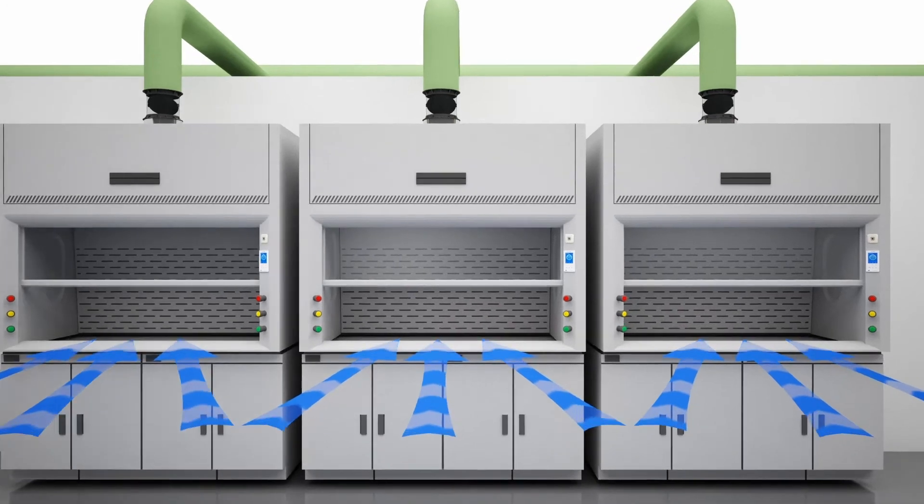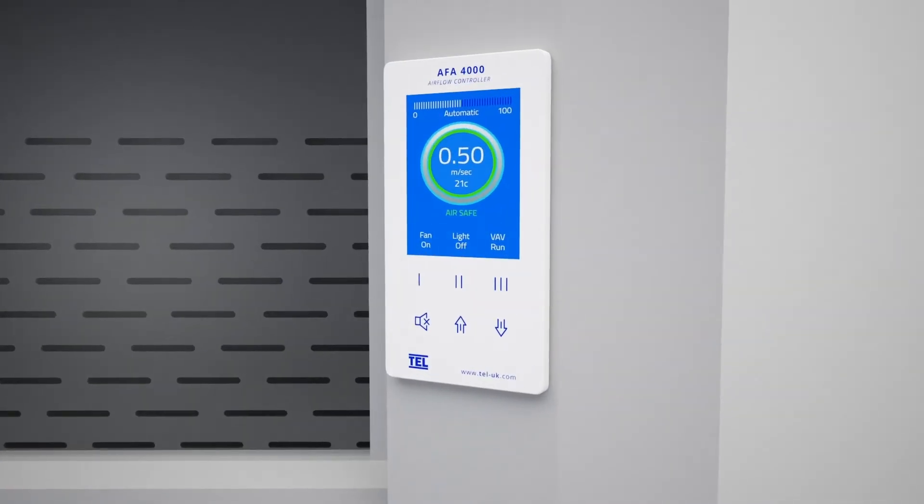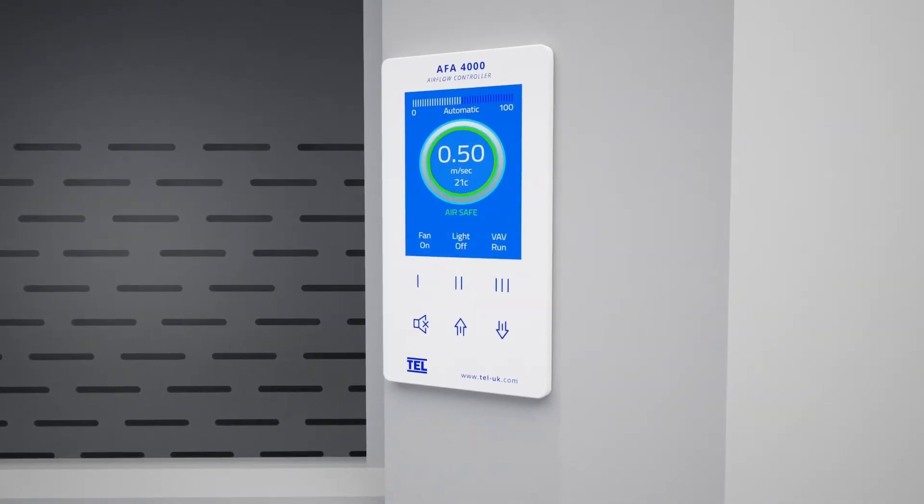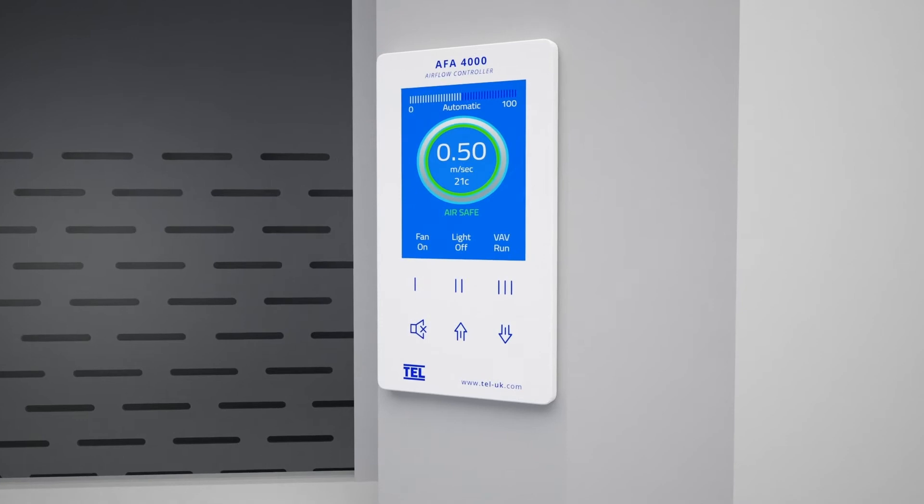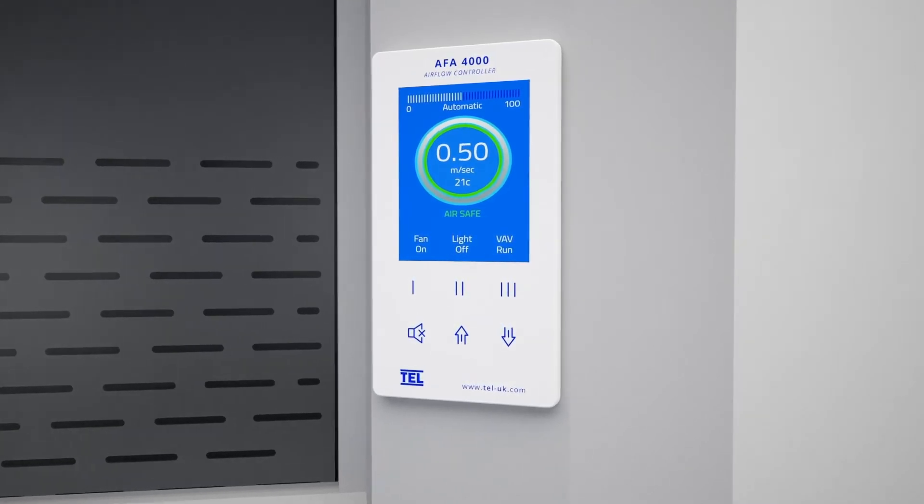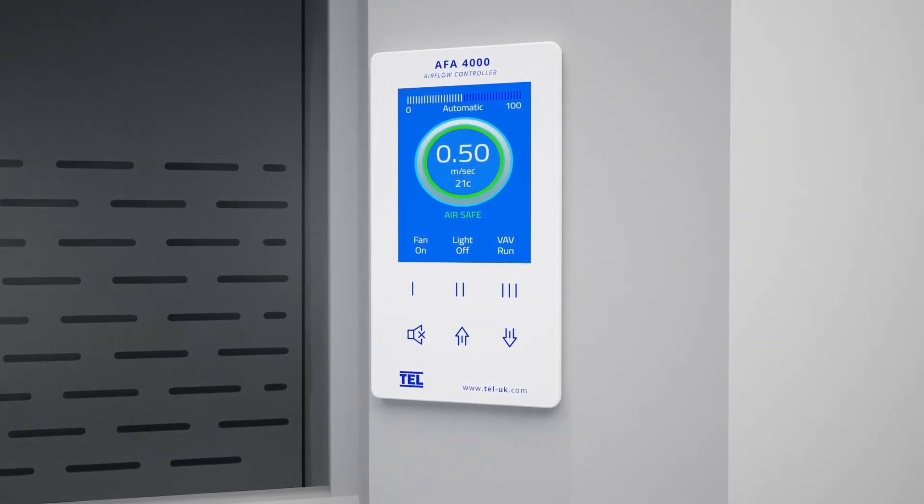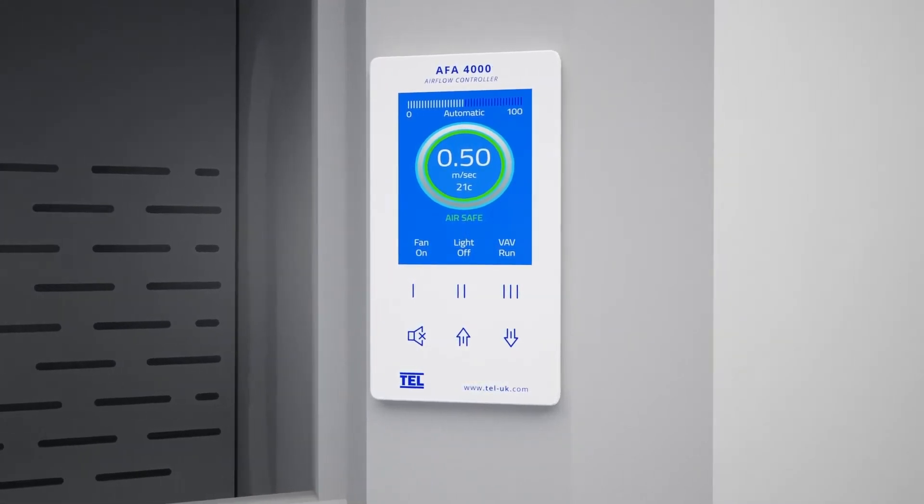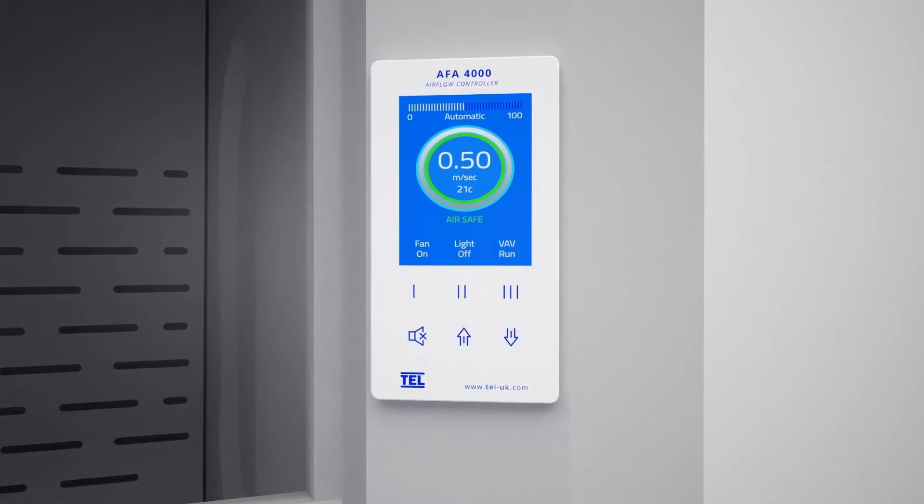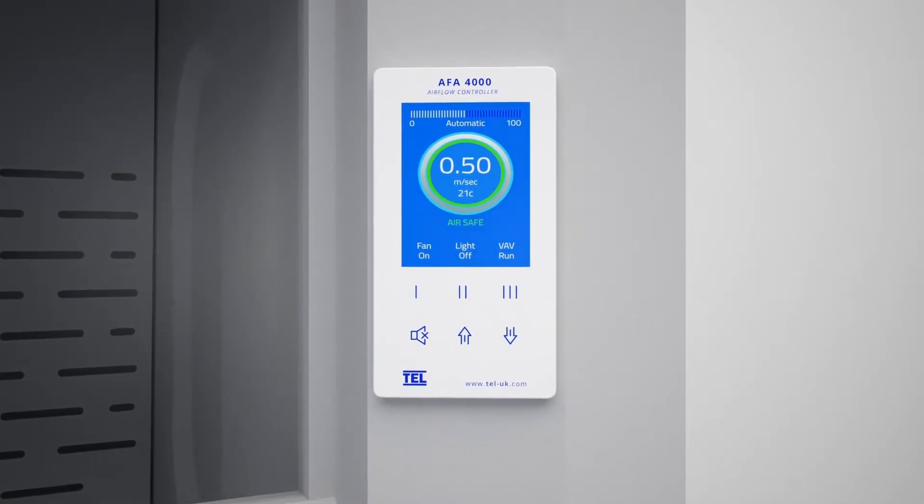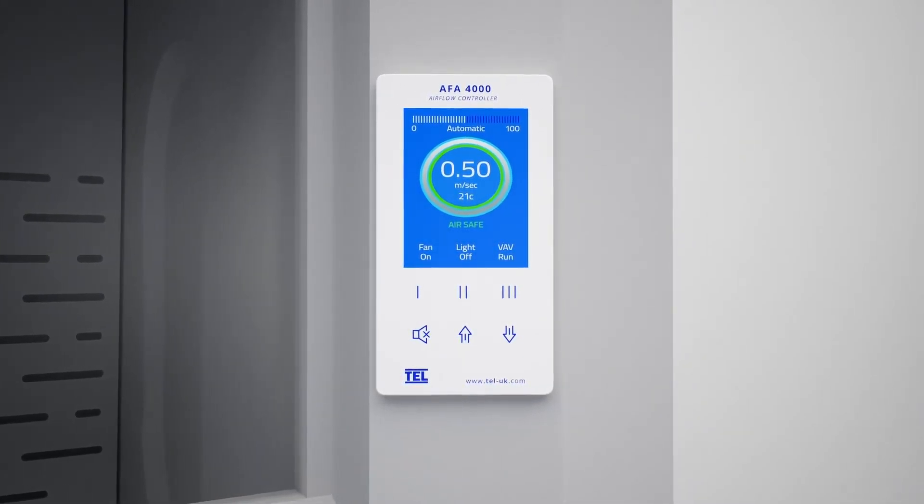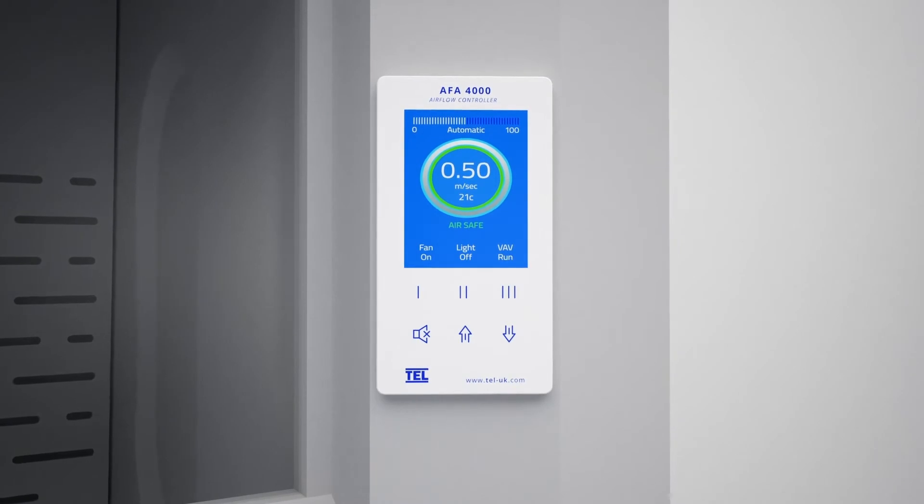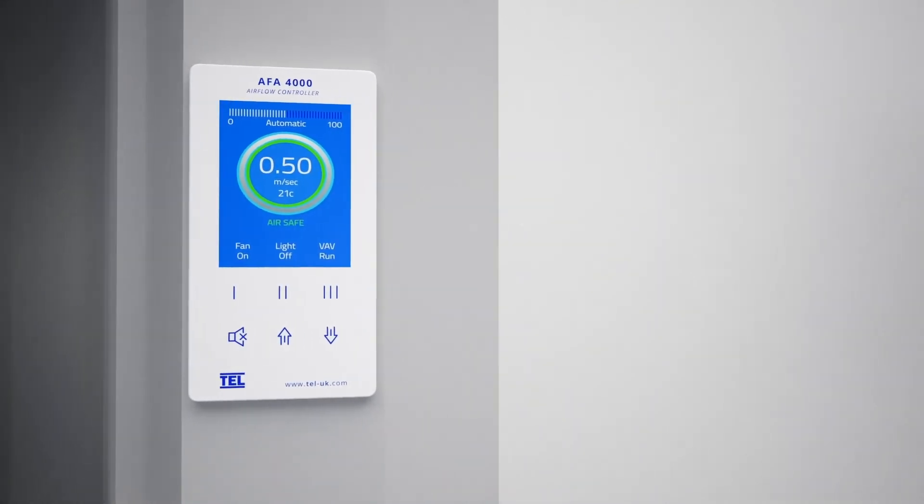The AFA 4000 boasts a 3.5-inch full-color high-resolution display. This intuitive user interface has been optimized for the best possible user experience, with clear user guidance and continuous velocity reading in meters per second or feet per minute.